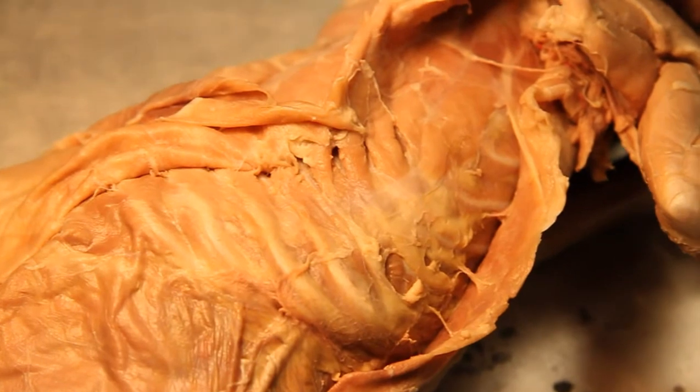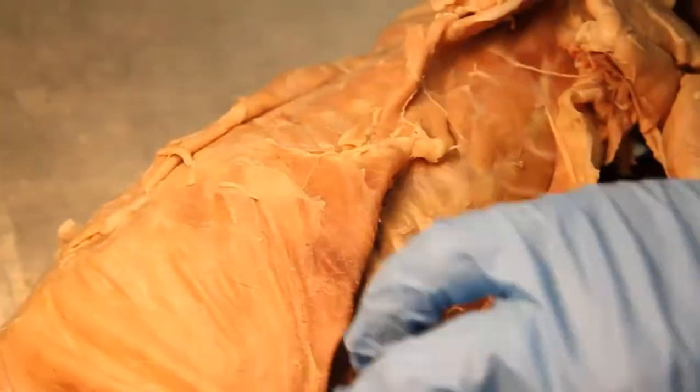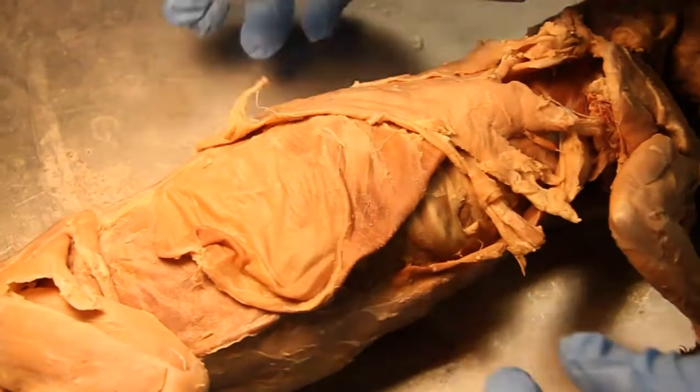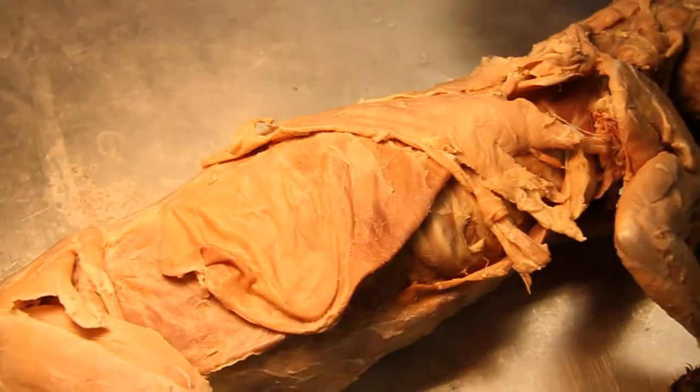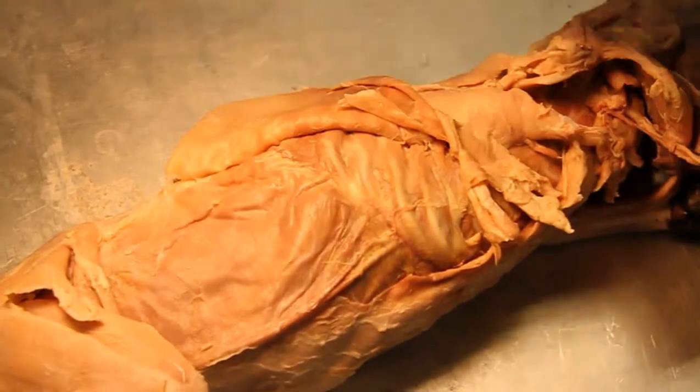What's that flap on top that's hanging up the whole thing? That is the external oblique. So when we peel that off, what do we have here? The internal oblique.